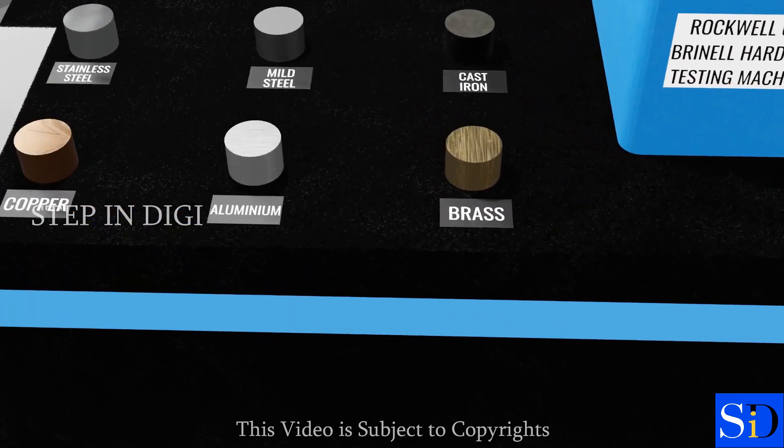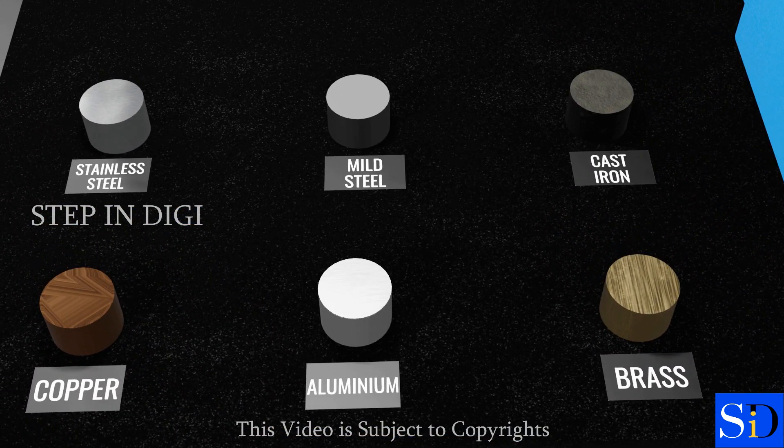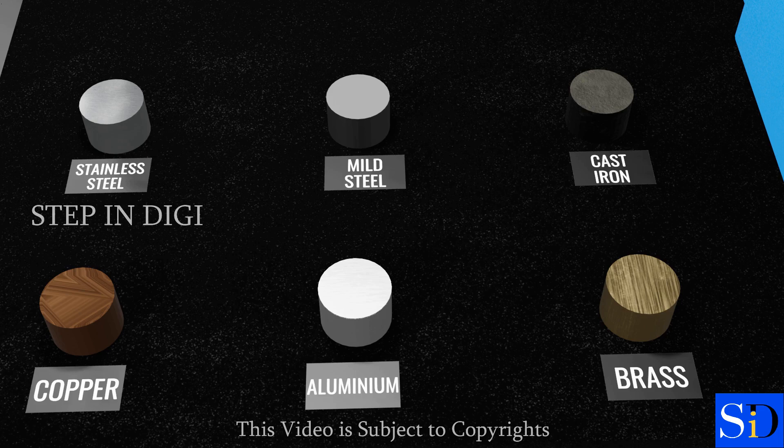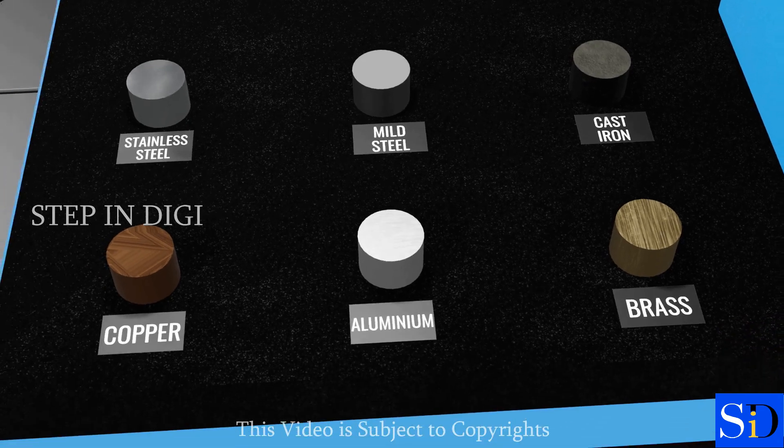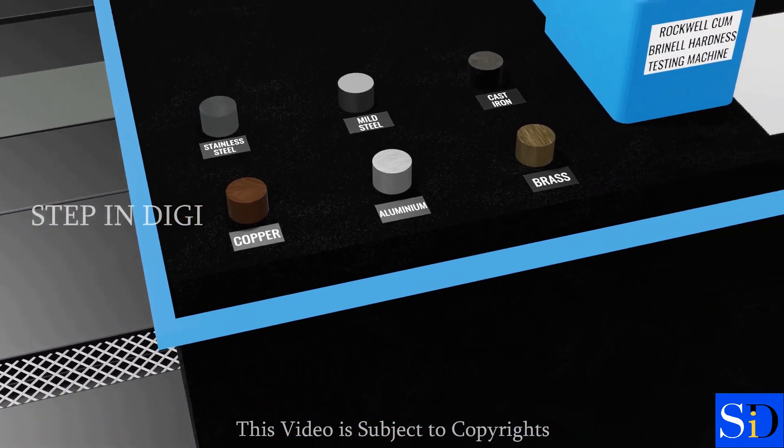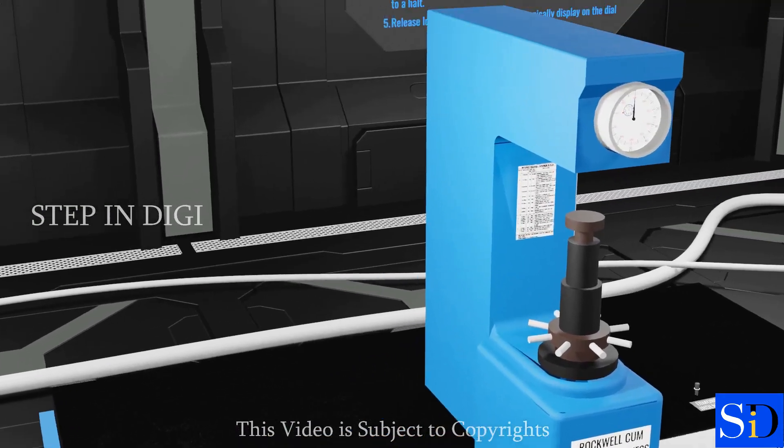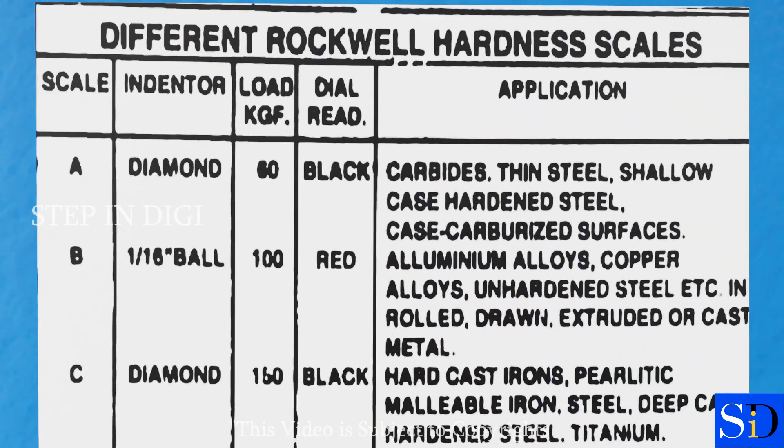The Rockwell hardness values for each material one by one. First, let us start with Aluminium. Before placing the test piece we have to fix the indenter on the machine. To find which indenter to use, let us look at the hardness scale given. Here, we can see that for aluminum, it's given as ball indenter with a load of 100 kgf.